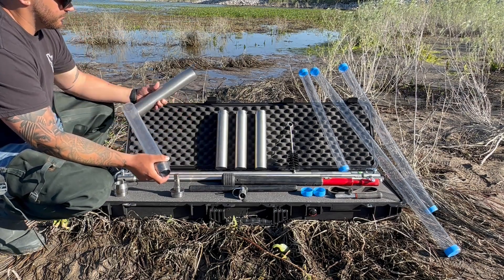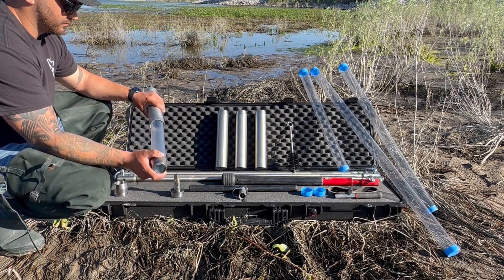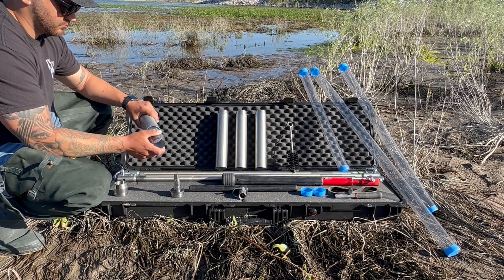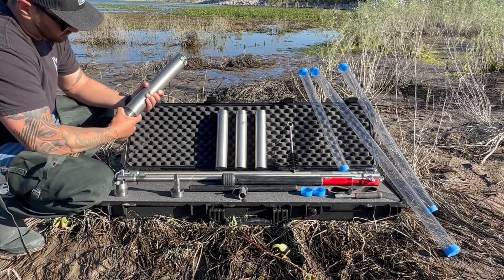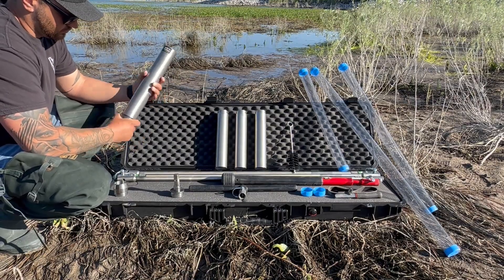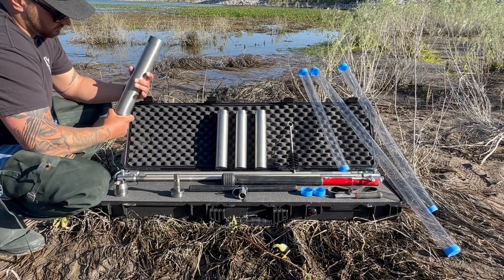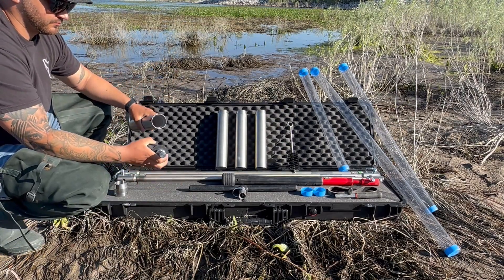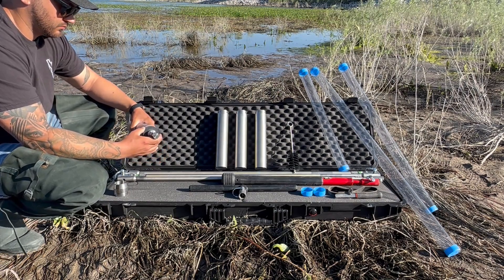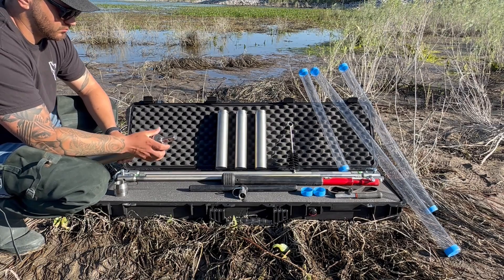Once securely fastened, attach the sampler base to the tip and thread them together. Finally, complete your sampler by securely threading the flat valve cap to the sampler base.